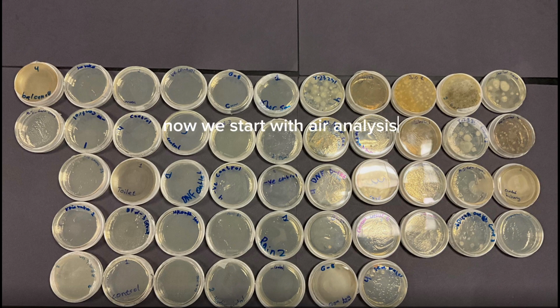Start by labeling media plates with your name or group along with control and specific areas such as the floor or doorway for sample placement. Leave the plates uncovered overnight in these areas to allow air exposure. Then replace the lids the following morning. Incubate the plates upside down at room temperature for 1 to 3 days or overnight at 37 degrees. And then observe the plates and see if there's bacteria or not.